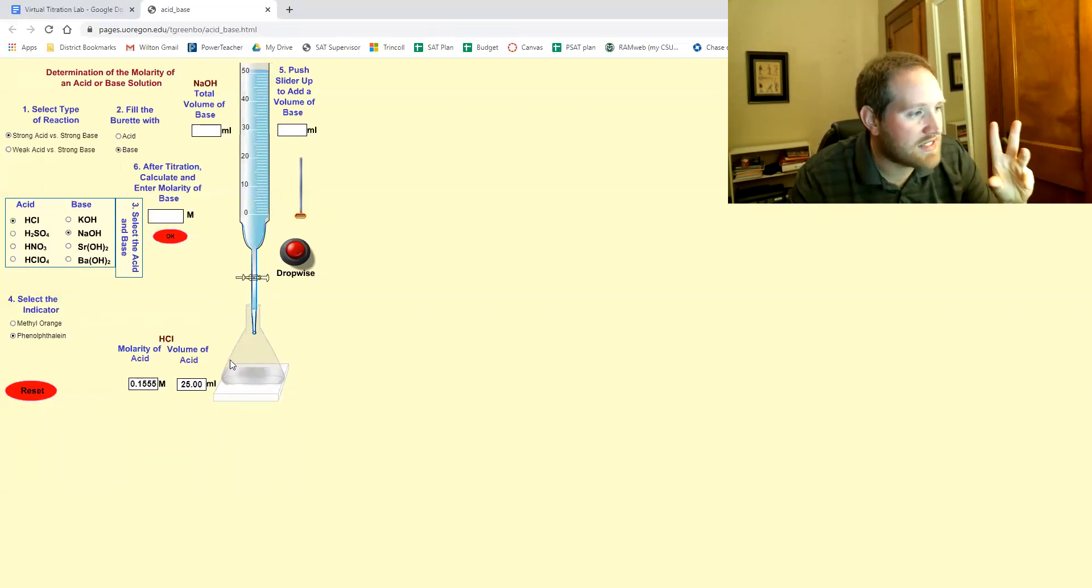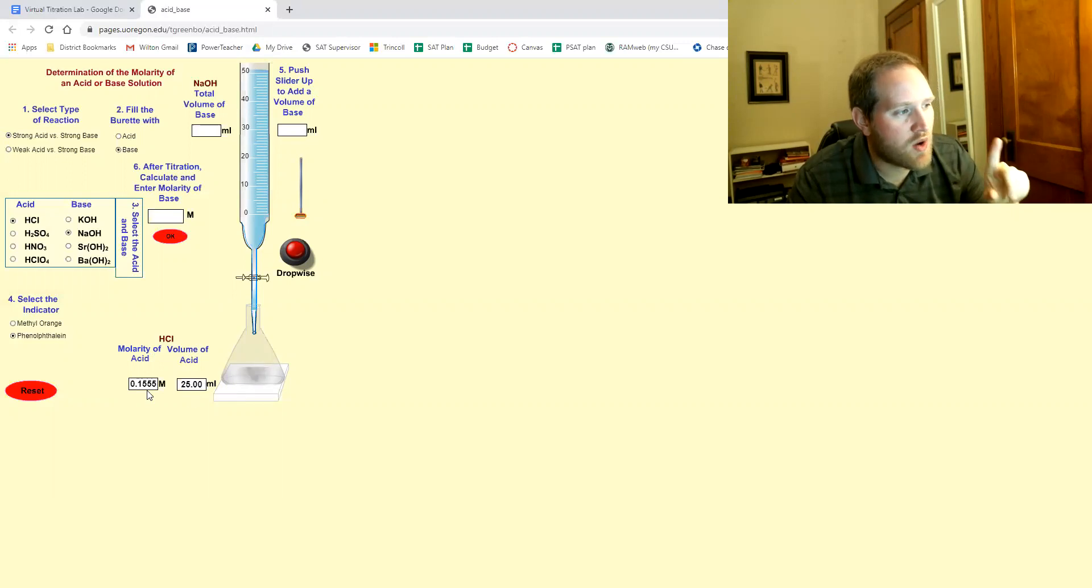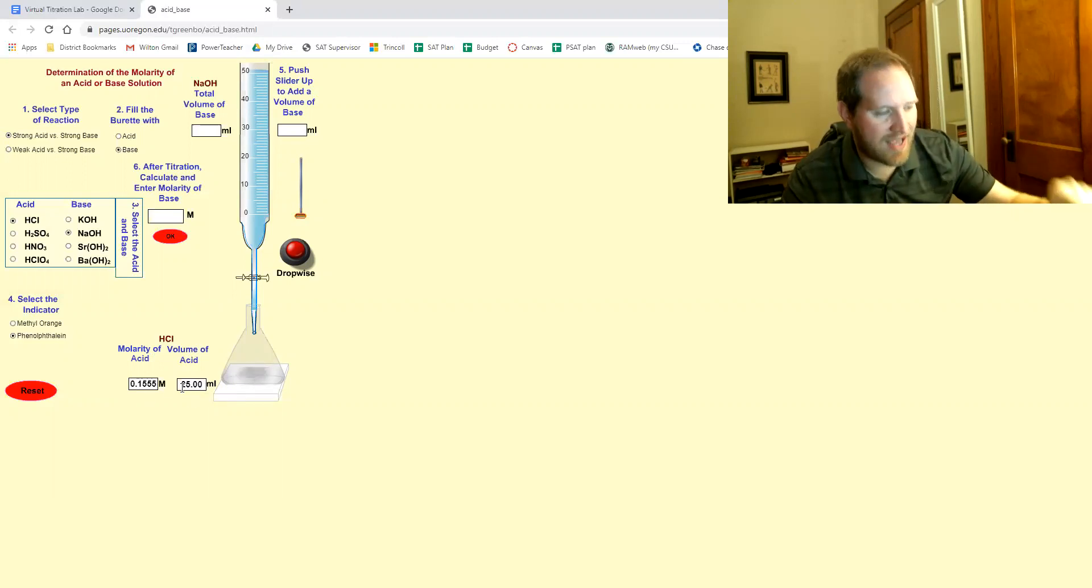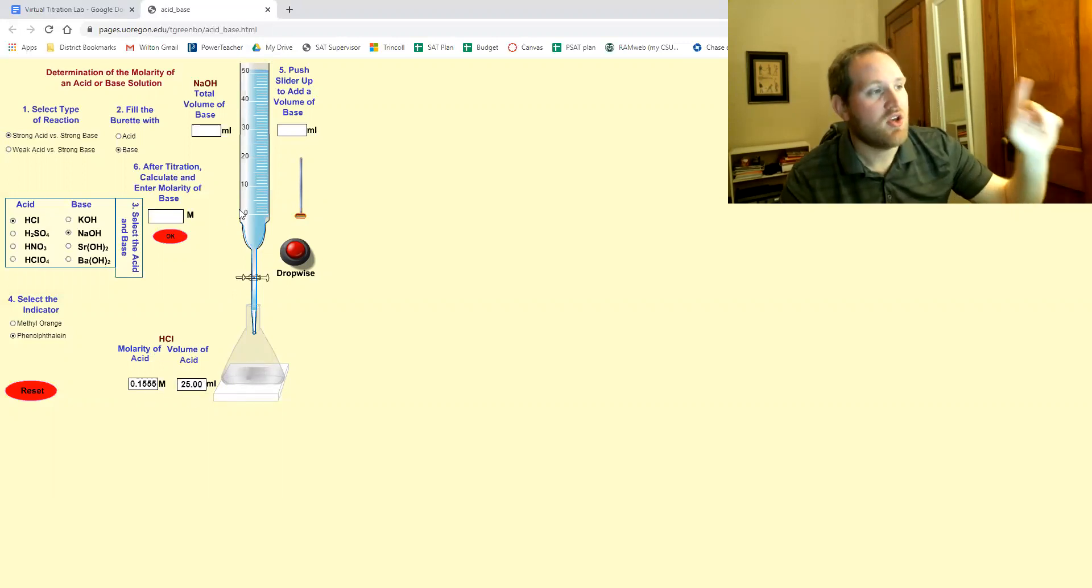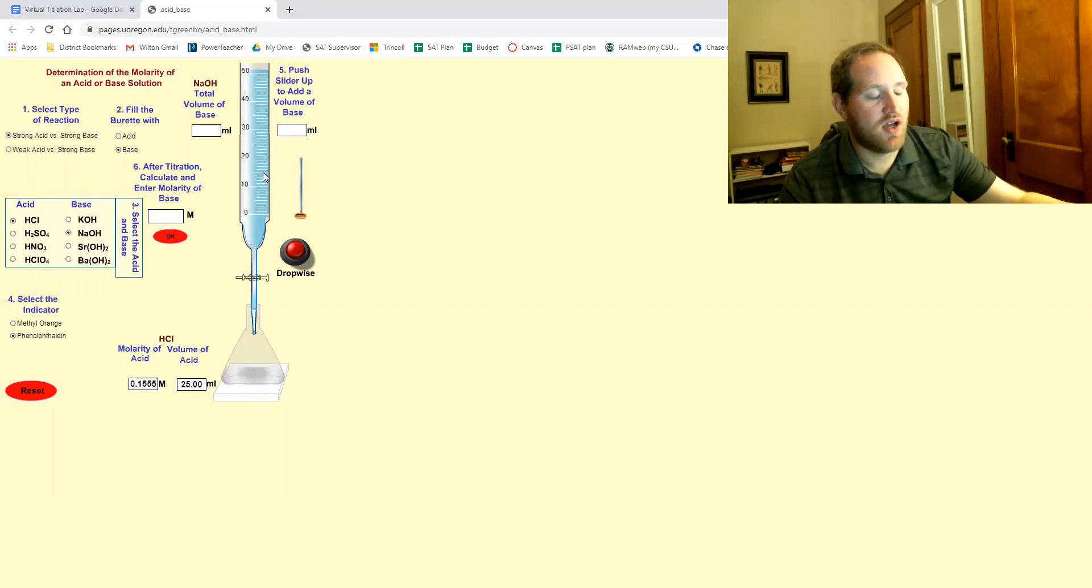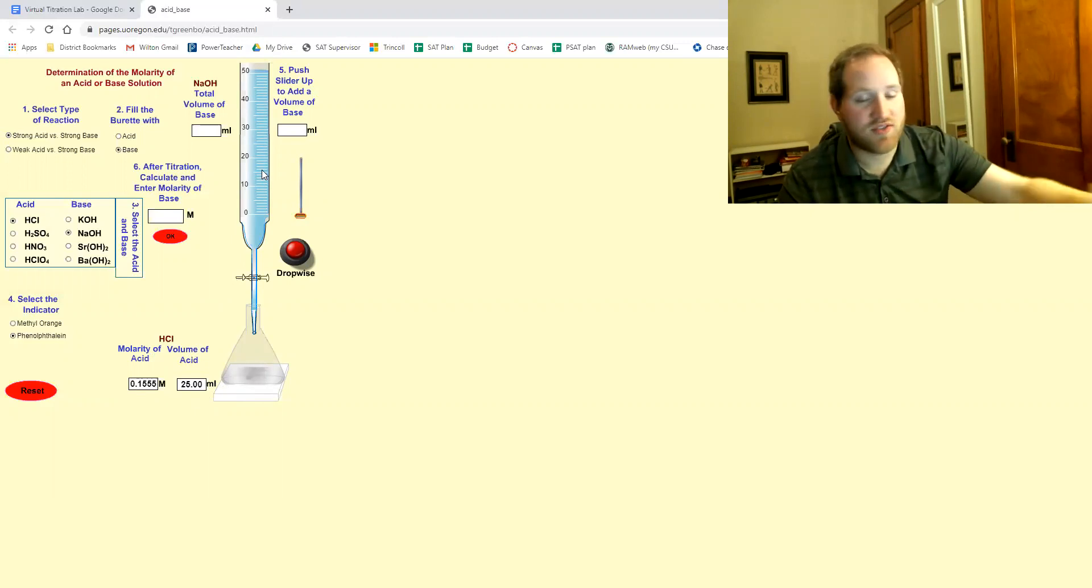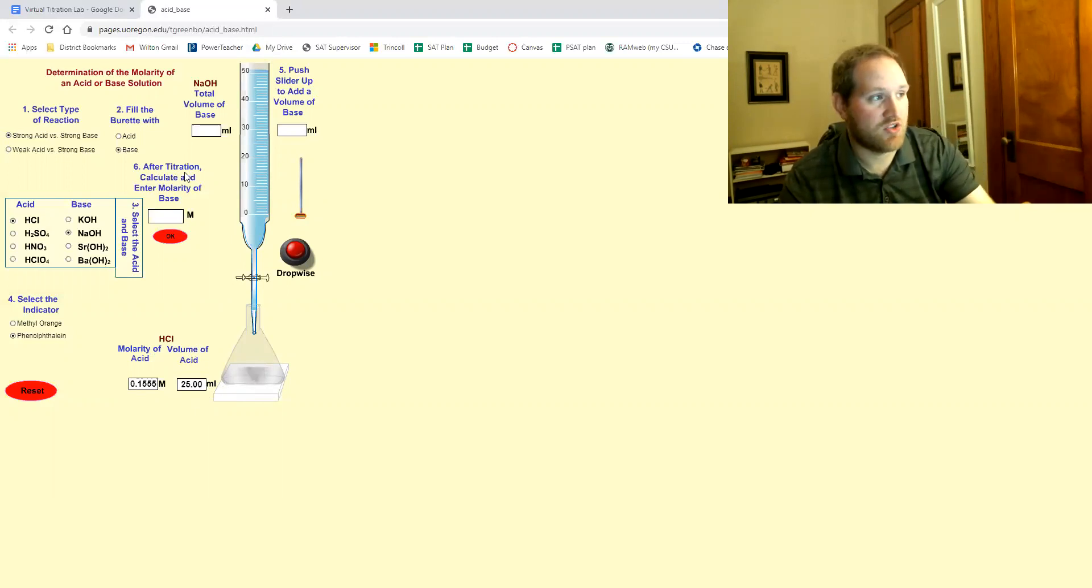So the idea is we know how much acid we have. We know the molarity of the acid. We don't know the molarity of the base. That's the goal of this lab which is going to go right here when you're done.